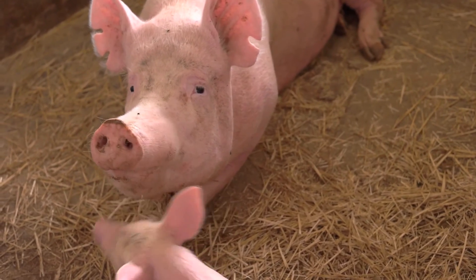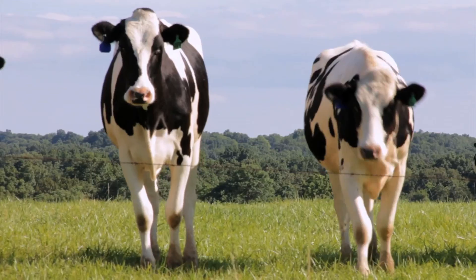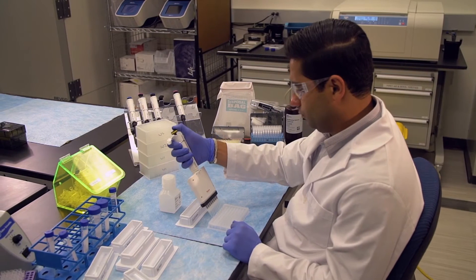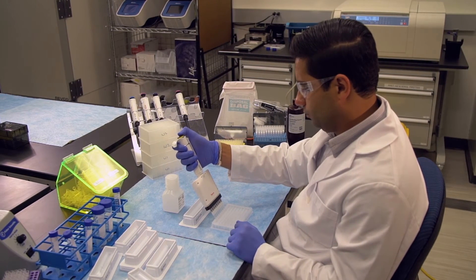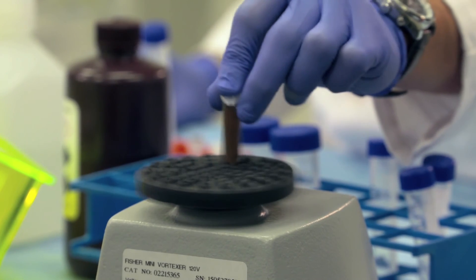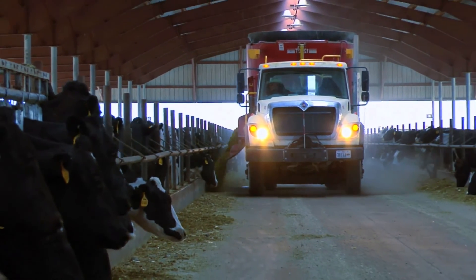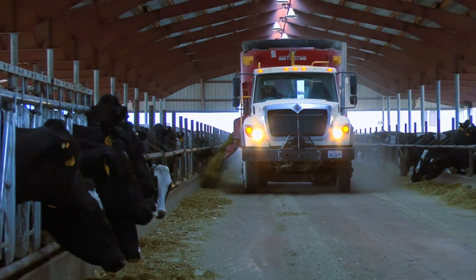Diagnosing farm animal health issues quickly and accurately is more important than ever before. Molecular diagnostic techniques such as real-time PCR can be used by labs to enhance animal health and productivity, and to help ensure that the global food supply remains safe and sustainable.